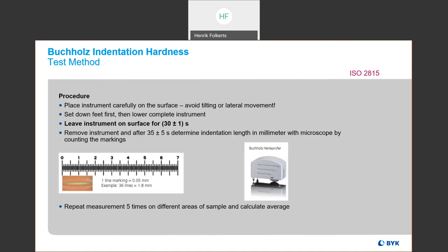And then the average should be calculated. And why do we need the average? Because the value will be more representative. Now let's have a look at the instrument.